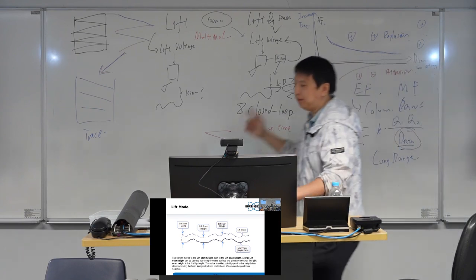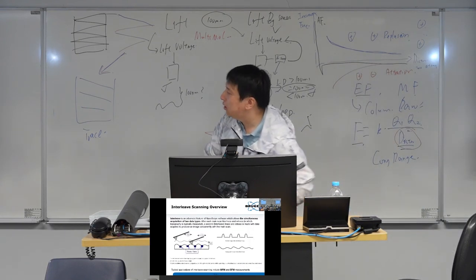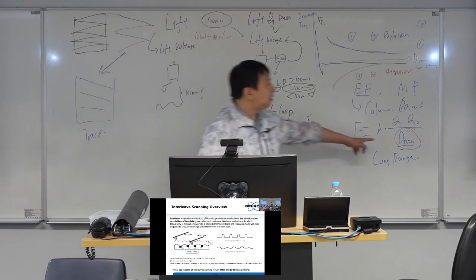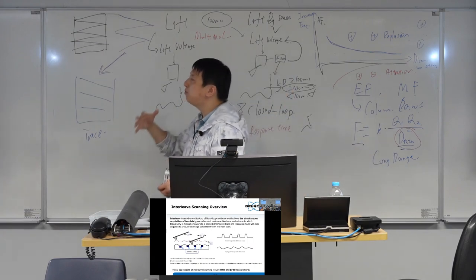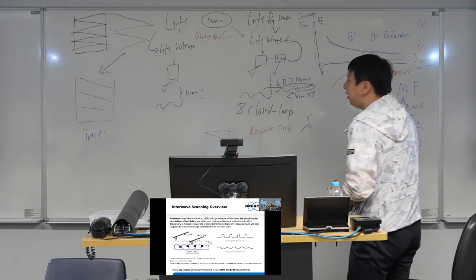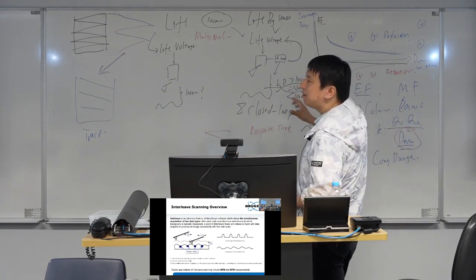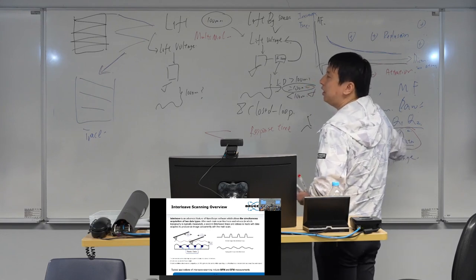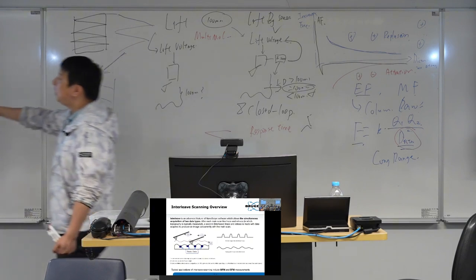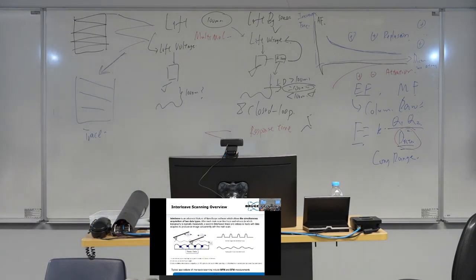So our idea here is we want to tell which part is charged, which part is not charged. But the force itself depends on the distance. So if we want to measure the force, we want to make sure it has a fixed distance, right? So in our lift setup, we scan twice.